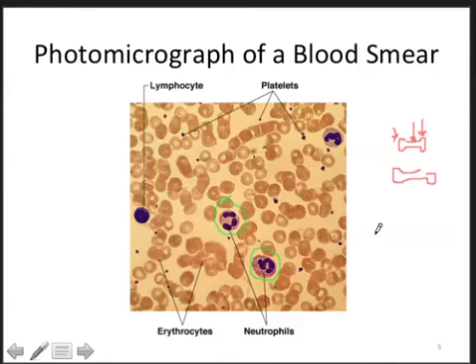They are primarily designed to fight bacterial infection. They engage in phagocytosis of bacteria, and they also initiate chemical attack on infected cells. You can also see a lymphocyte in this picture, and we'll circle that here. Okay, and that's our lymphocyte.